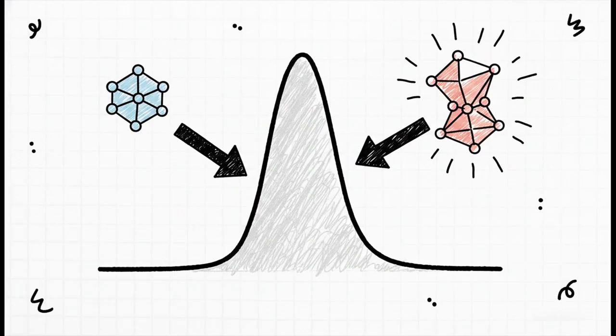But of course there's a catch, right? What happens when that peak broadening isn't just coming from the tiny size of the crystallite? What if the crystal lattice is stressed or warped, or maybe it's just full of defects? Well, that structural microstrain also causes the peaks to widen. So if you just blindly use the Scherrer equation, you might incorrectly assume your particles are way smaller than they really are. This is exactly where we need the Williamson-Hall analysis to step in, to neatly separate the size broadening from the strain broadening.